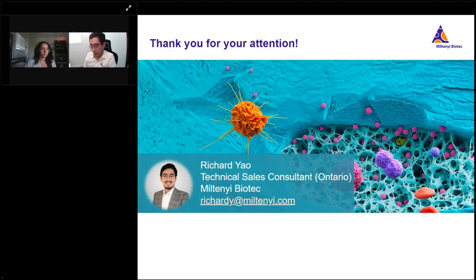And the major reason, again, is that ultimately it is an imaging measurement based on morphology. The result could be improved by the experience of the technician, but we will never be able to get rid of a certain degree of subjectivity within it, especially if you are measuring by visual inspection. But in this kind of situation, especially if the lab has not previously had flow cytometry experience, then I would say that to start with, you will need some guidance or support.